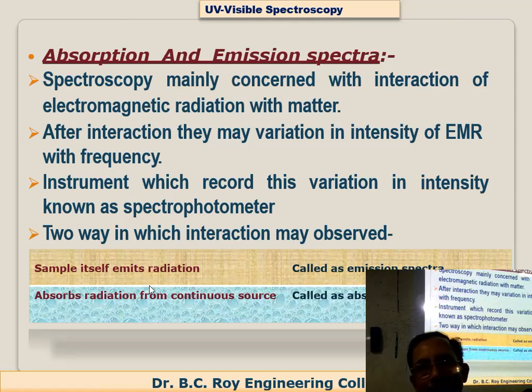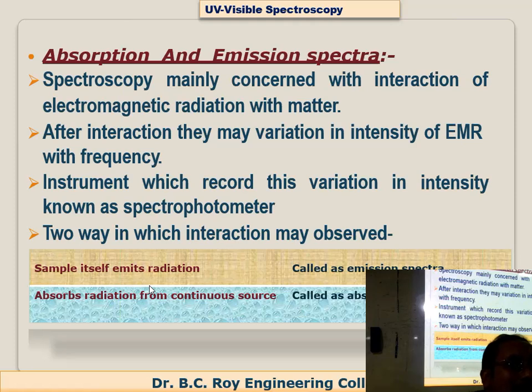That is the machine. Now, what is emission spectra? Spectra is the plural form. Spectra, spectrum, spectra. So, spectra is the plural, spectrum singular. Now, emission spectra. What is that? You have some matter which is already excited, heated up or something like that. In front of that you put some photographic plate and remove the source of any sort of radiation. Then what will happen? From the excited matter, maybe heated up, energy radiation comes out and automatically falls onto the photographic plate, and you get some spectrum. That is called emission spectra.